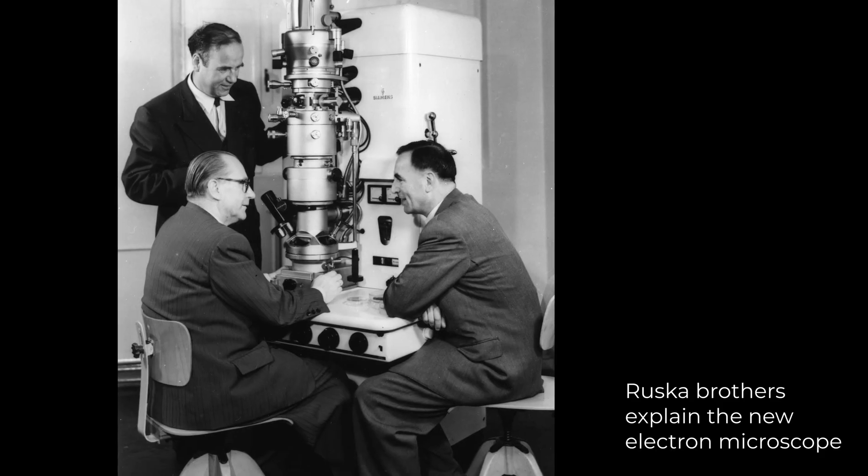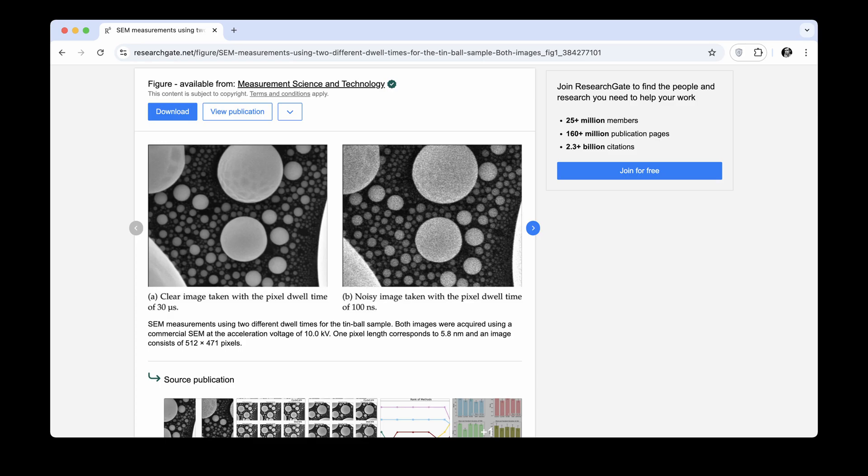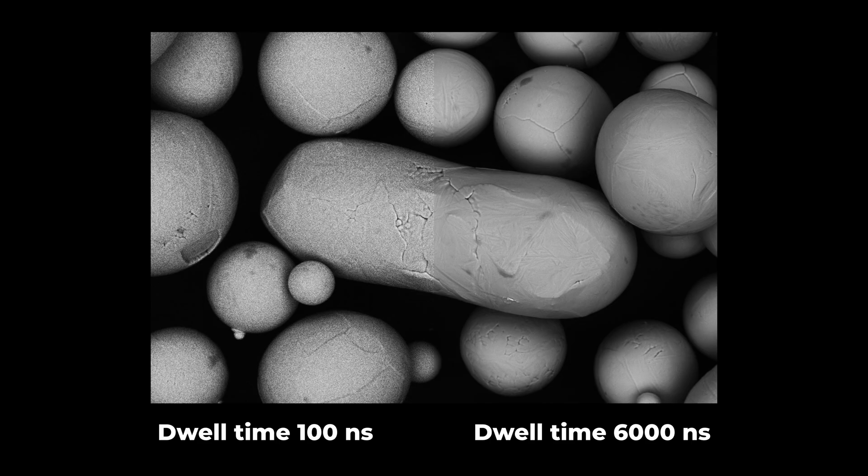Experienced users may object to me because they use higher dwell time settings for collecting the signal on low kVs. The scanning speed decreases and we can collect more signal in every point. But in this tabletop microscope I have no way to adjust the dwell time without hacking the software mode.